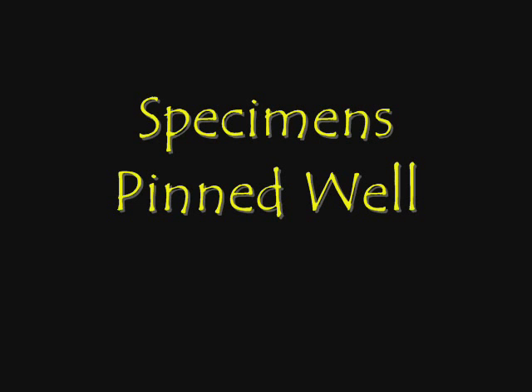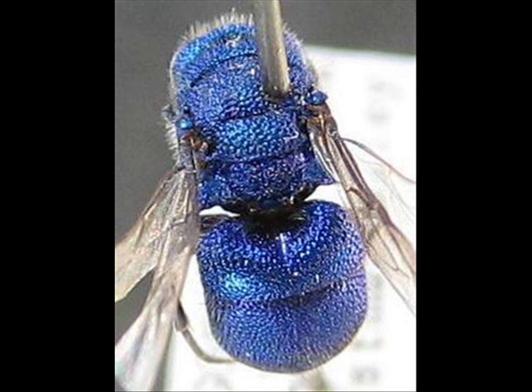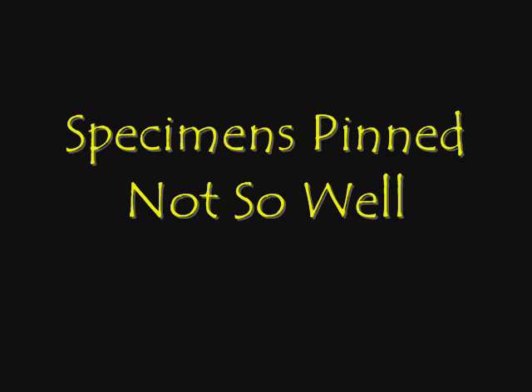We want to show a few pictures of specimens that have been pinned very well and a few that have not been pinned well. Here's a specimen with a pin in the far right-hand side, away from the center line, near the tegula — that's a specimen in the proper position. Here's another one in the same sort of location. You can clearly see the pitting and the other hairs that are often located in the middle.